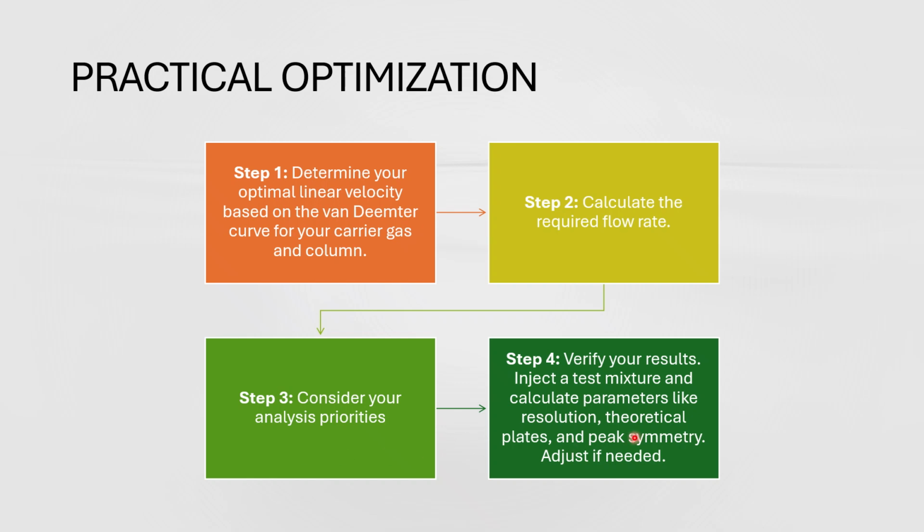And step 4 is verify your result. Inject a test mixture and calculate parameters like resolution, theoretical plates, and peak symmetry. Adjust if needed. Let me give you a real world example.